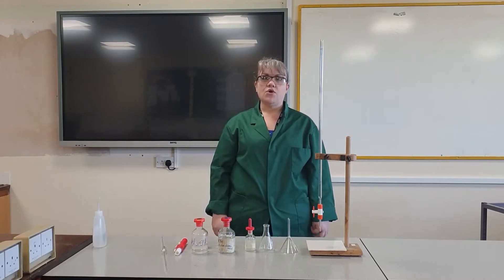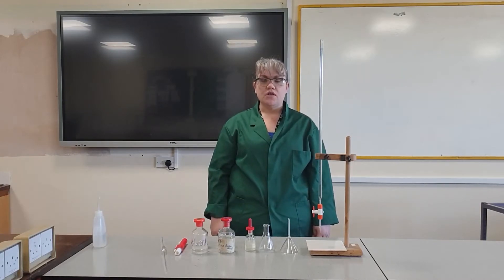Hello, today I'm going to show you how to carry out a titration with indicator.